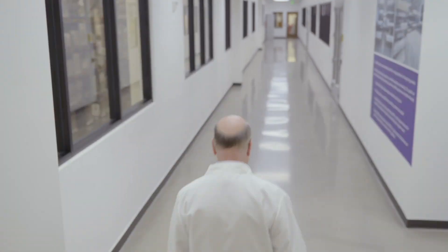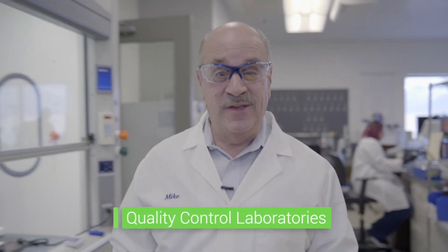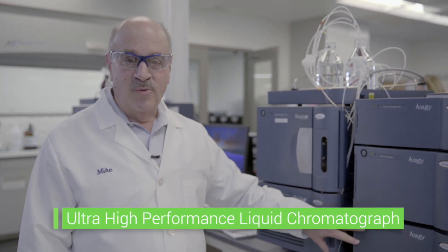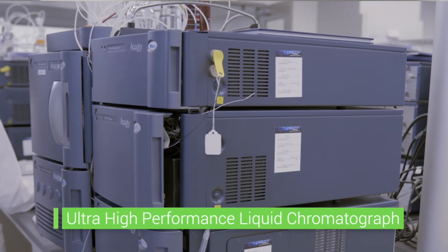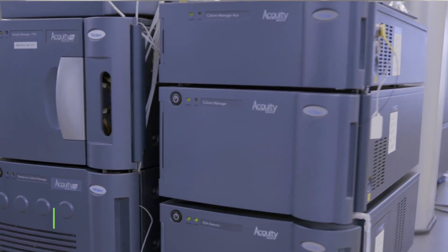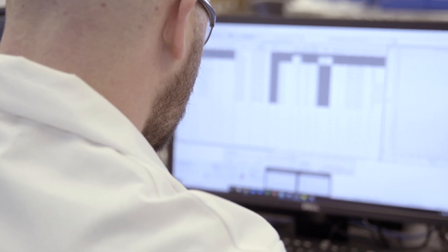Come with me to the lab and I'll show you some of the tests that we do. So here we are in the quality control laboratories at Young Living. I wanted to show you a few of the tests that we actually use to ensure that you're getting the best CBD products possible. This is an instrument called an ultra high performance liquid chromatograph, and we use these instruments to measure the amount of CBD in every product to make sure you're really getting your money's worth. We also use instruments like these to make sure that you're actually getting 0% THC.